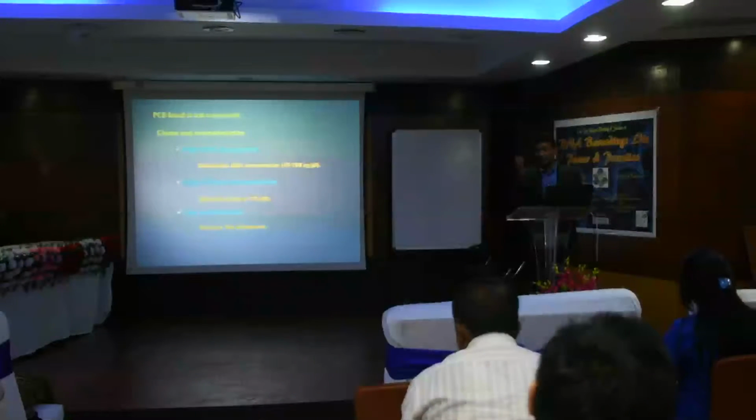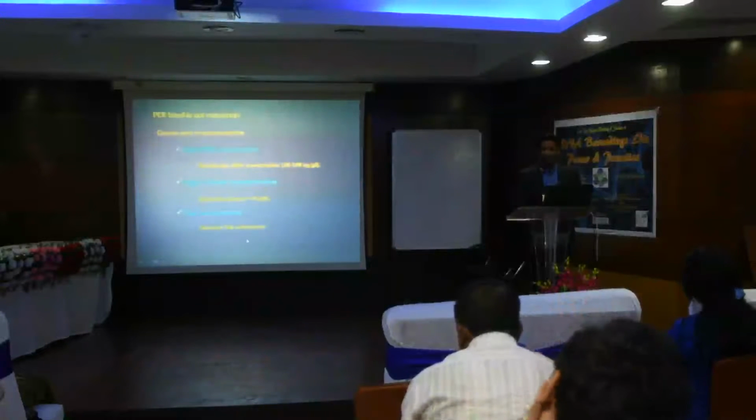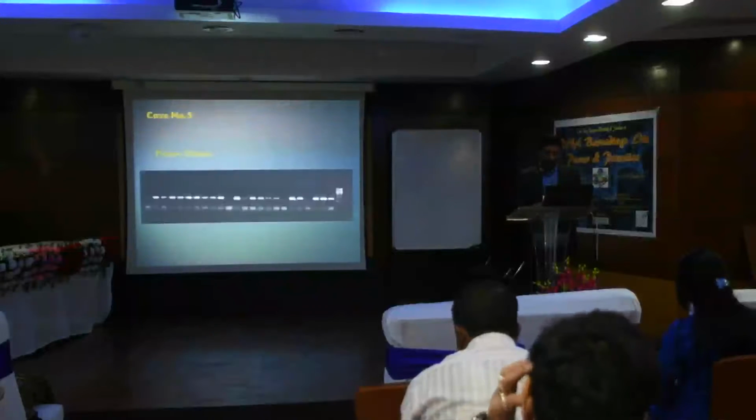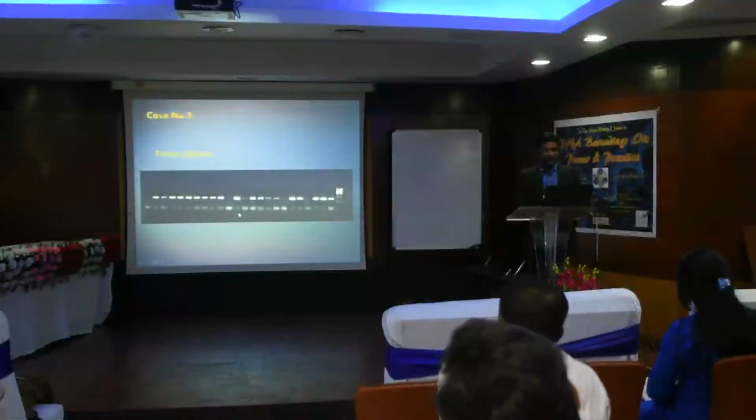Don't feel happy looking at it, thinking there is a primer and now I am putting it in the reaction. Don't feel happy. Then Taq polymerase also can do this. So decrease the Taq polymerase here. Extra Taq polymerase gives opportunity to have more binding, so that can be avoided here. Then the fifth case is primer dimers.